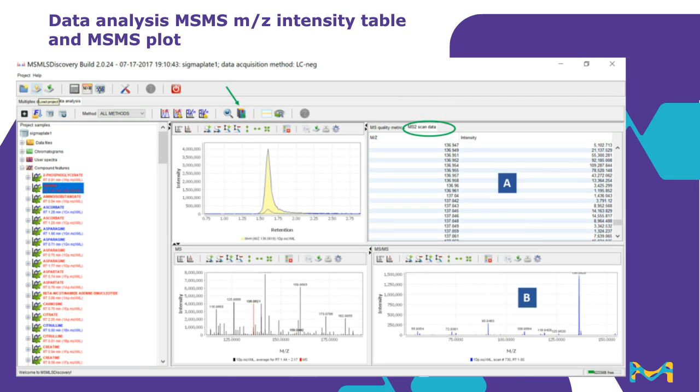Okay, so the next step is to carefully review all of the data and curate it if necessary. As you know, a good thing to do is look for good peak shape, good peak intensity, and compare retention time across positive and negative modes. Data can be removed for results where the automatic algorithm has failed simply by clicking on any bin or any individual adduct in the tree, right-clicking, and selecting the delete command.